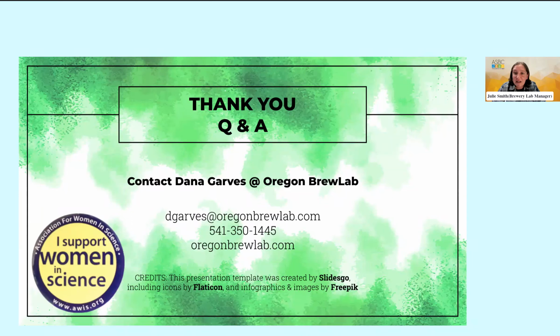Do you find the results are the same with the isooctane reduction across all beer styles, like double IPAs, hazies, lagers? Yeah, I haven't had any issues, and I have been TTB certified using this method since 2014. So I am the poster from 2008. I did look for it, but I couldn't find it.